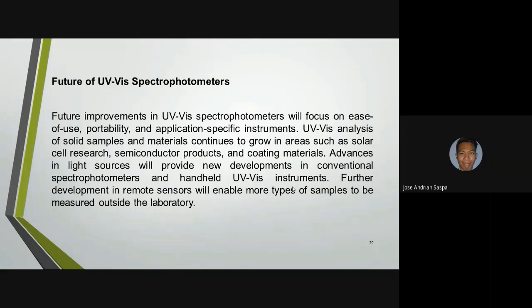For example, analysis of solid samples and materials continues to grow in areas such as solar cell research, semiconductor products, and coating materials. Further development in remote sensors will enable more types of samples to be measured outside the laboratory. So that is the future of UV-vis spectrophotometers.